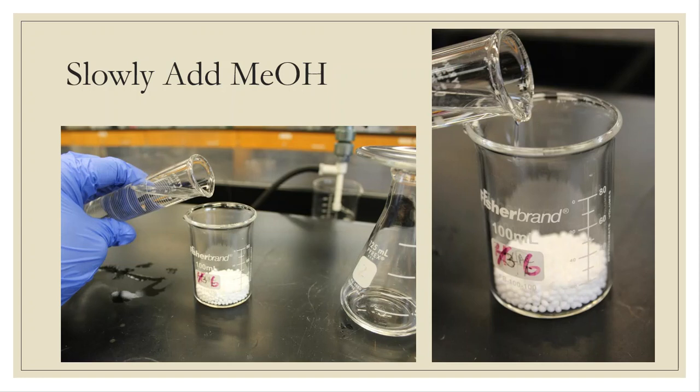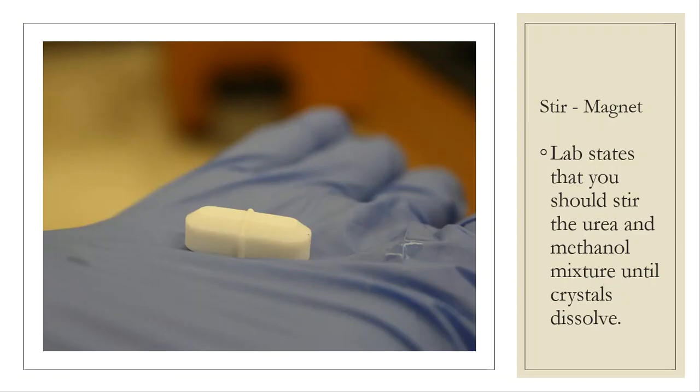Now, in the beginning, here's the problem. It's not going to dissolve very well. So the lab directions are going to tell me to stir this solution. All right, so that means I need to get a magnet. So I've got a magnet now, and I've also put on gloves because I'm working with methanol, and I don't want methanol to absorb through my skin because it can be poisonous. It can make you go blind if you're not careful, and I'm working with a lot of it. So now I've put on gloves. I've actually wised up and put on a pair of gloves to protect myself. All right, so there's the magnet.